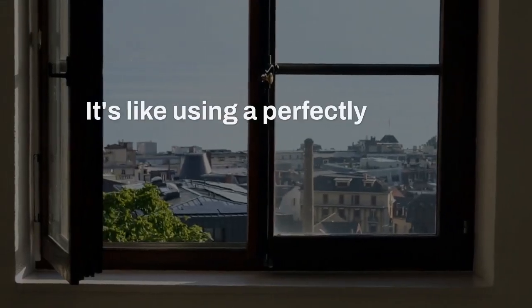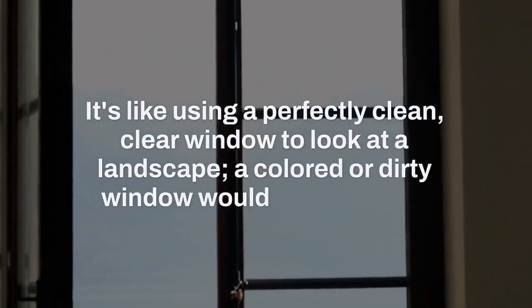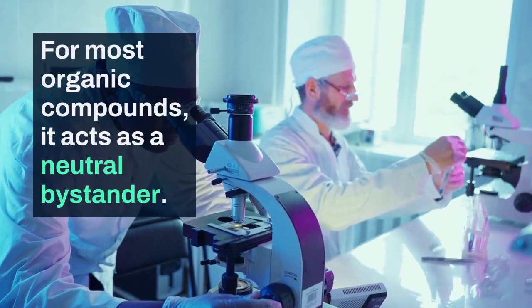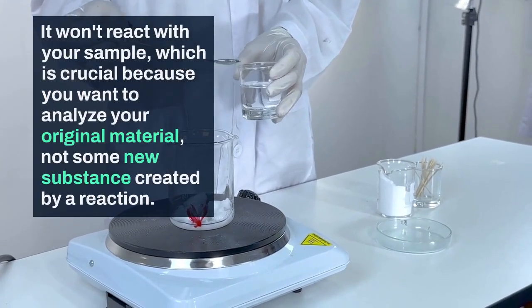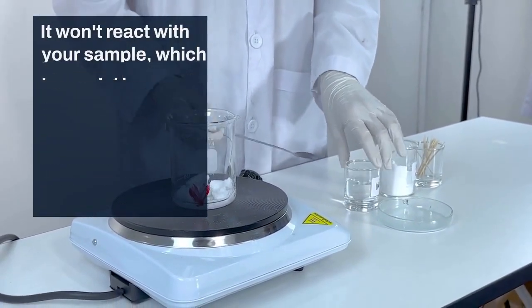It's like using a perfectly clean, clear window to look at a landscape. A colored or dirty window would ruin the view. The second reason is that KBr is chemically inert. For most organic compounds, it acts as a neutral bystander. It won't react with your sample, which is crucial because you want to analyze your original material, not some new substance created by a reaction.